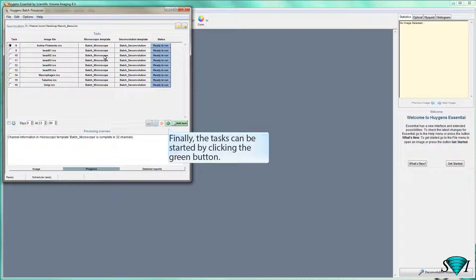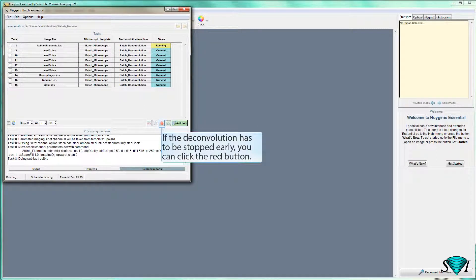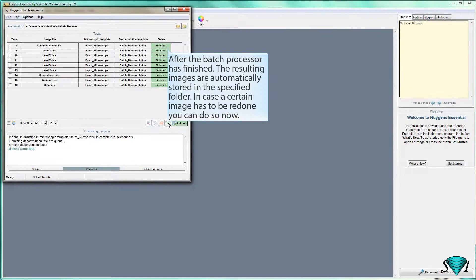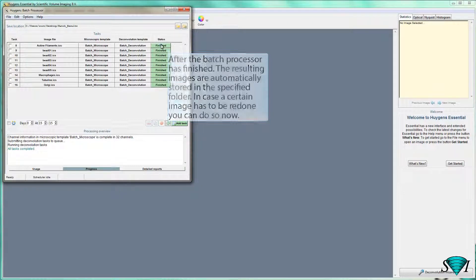Finally, the tasks can be started by clicking the green button. If the deconvolution has to be stopped early, you can click the red button. After the batch processor has finished, the resulting images are automatically stored in the specified folder. In case a certain image has to be redone, you can do so now.